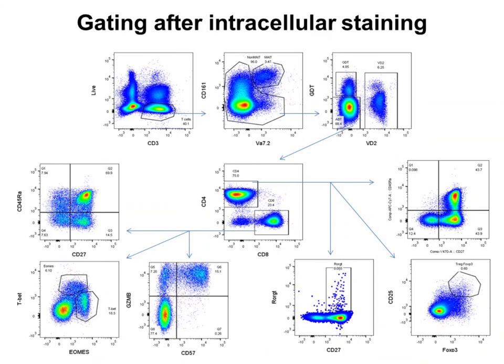Okay. So basically, this is just to show you that, same as for the TH markers, adding additional markers in a well-designed panel enables you to immediately end up with a nice result. We didn't have to run a series of testing and changing the combinations to end up with this result. Spending time on the thinking enables you to optimize also in terms of saving time and cost and ending up with such a stain.